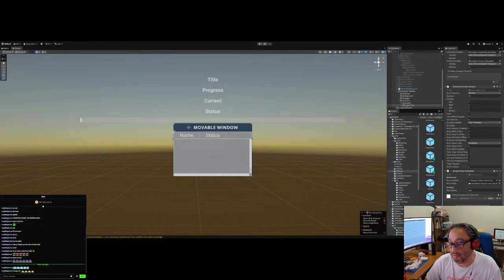If you want to, you could make it 100. You can make it 1,000, but I suggest 50 to 100 is good because that keeps the query from being too long for the network. If you have a slow network, it could slow down, so you could set all this in a screen, pop-up or modal, say user preferences, and that way IT or the user could set what they're patient enough to handle. If they want a fast query, you do 50.